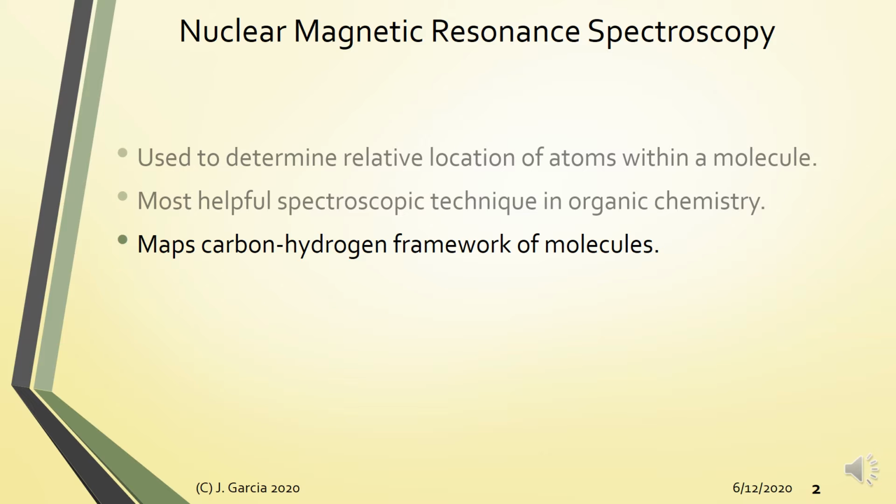Okay? So, for carbon-13 NMR, familiar tayo. Proton NMR, we're familiar with that. Basically, it maps out the framework of your molecule. Okay? So, it is usually used in tandem with other spectroscopic techniques such as mass spectrometry and FTIR spectroscopy and even UV-Vis spectroscopy. But even with just the NMR and the molecular weight information, you would be able to deduce the structure of a simple organic molecule.